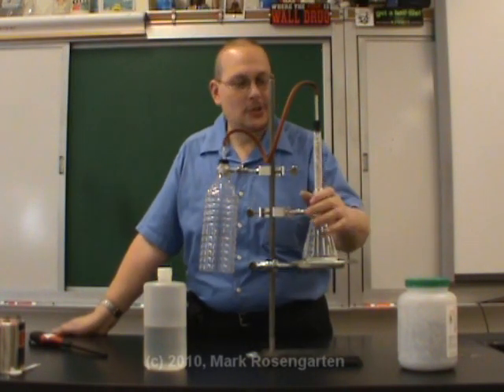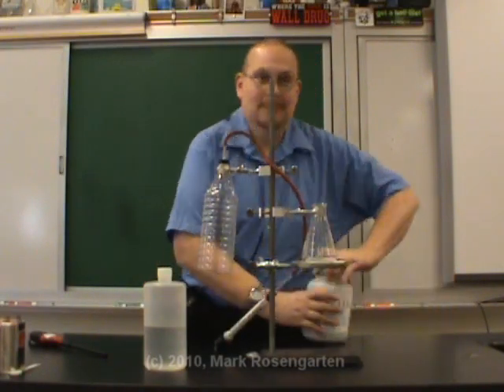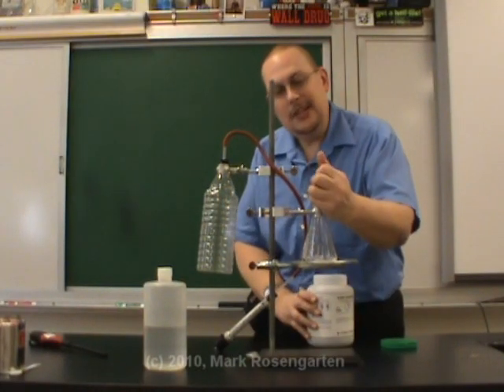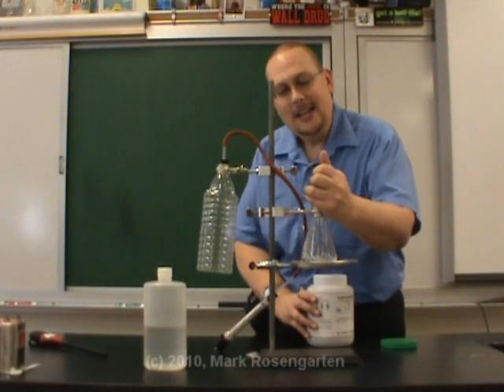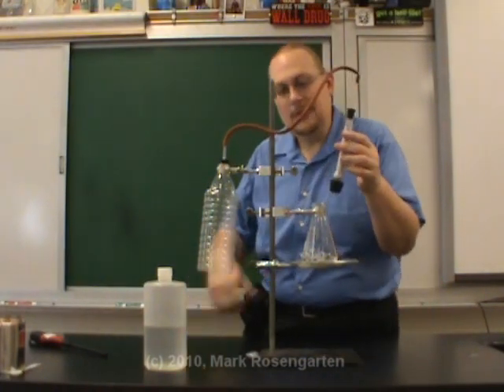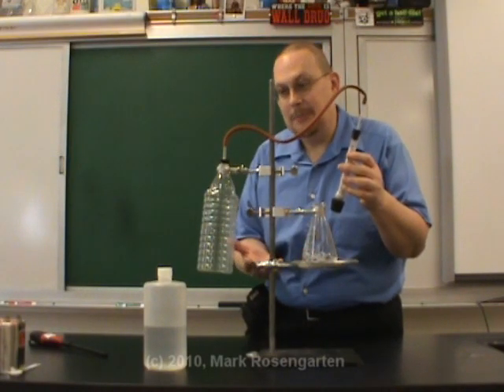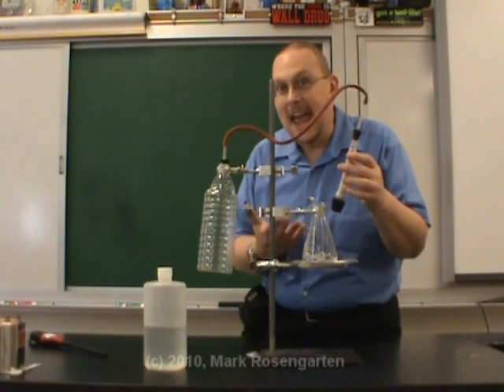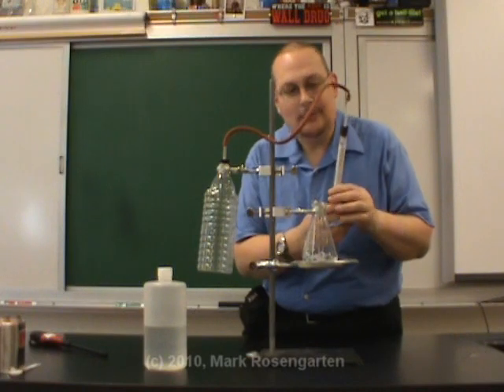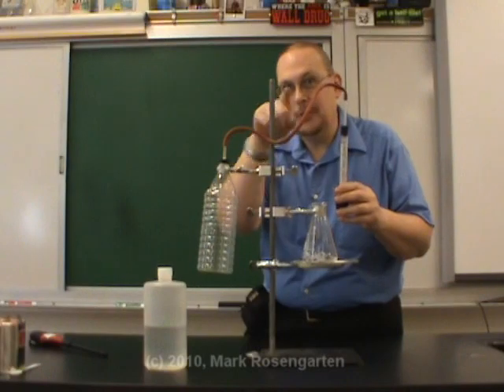This here is a reaction flask into which I'm going to place some zinc metal. Notice the incredibly careful way in which I measure this zinc out. This is a drying tube — when I carry out the chemical reaction I'm about to carry out, it's going to generate a fair amount of water vapor. I don't want water vapor contaminating my final result, so this contains crystals of a mineral called drierite, which will remove the water vapor, leaving just the product I want to produce to come out the other end.